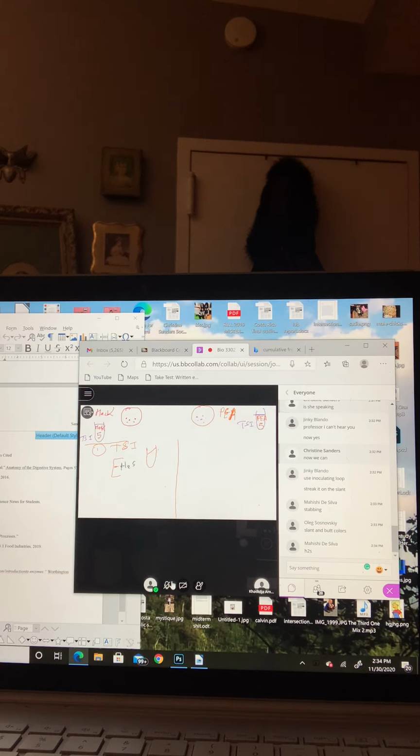The third thing: the slant and the butt color tell us the type of carbohydrate that your microorganism can metabolize or not. Because the TSI includes three types of sugar: glucose, sucrose, and lactose. So it depends on the color of your tube for the slant and the bottom.